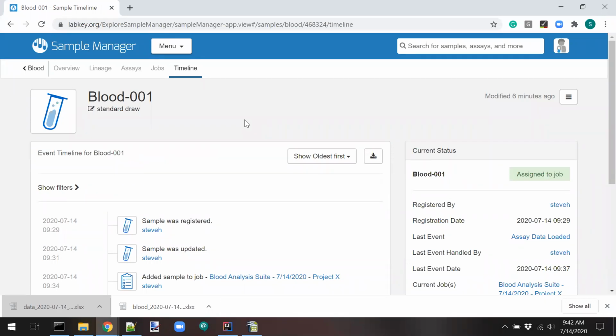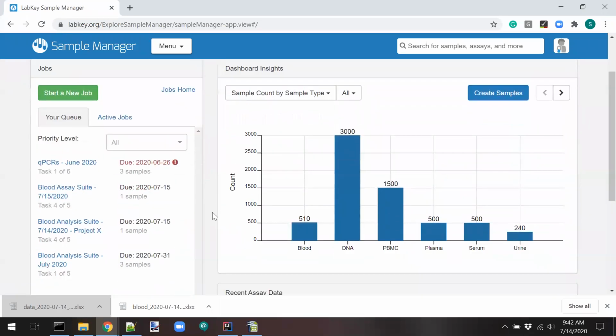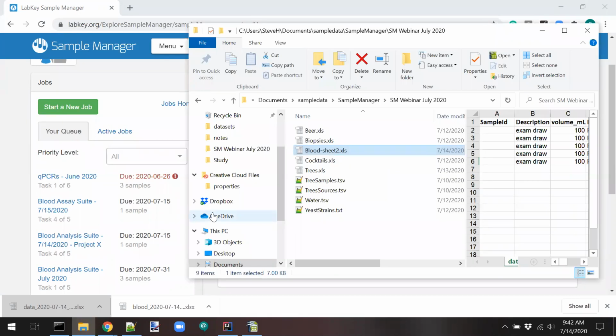Sure. Great. Well, as the final part of the demo, I wanted to show you what it's like to create a brand new sample type. Like we're just starting from scratch. This would be the first thing you'd really do if you were to get your own instance of Sample Manager. And I really also wanted to stress how broad the capture mechanisms are inside Sample Manager. It's not just limited to biomedical data. It's not just limited to vials.